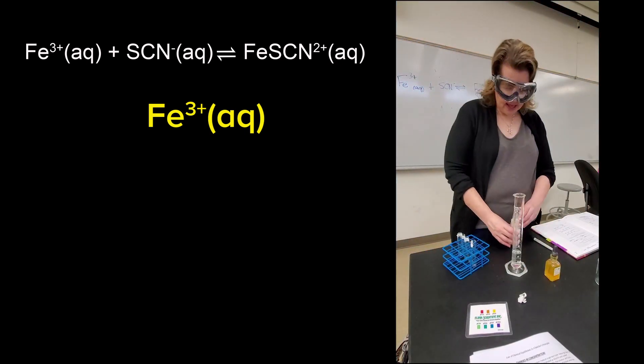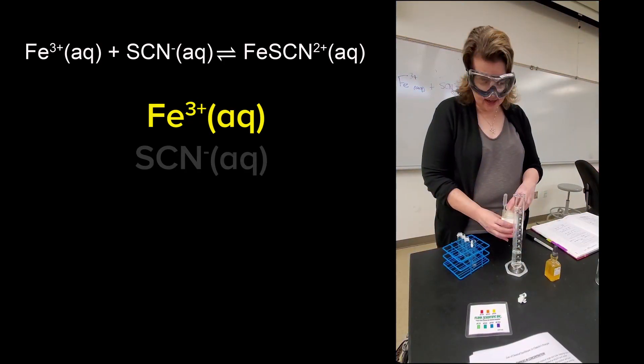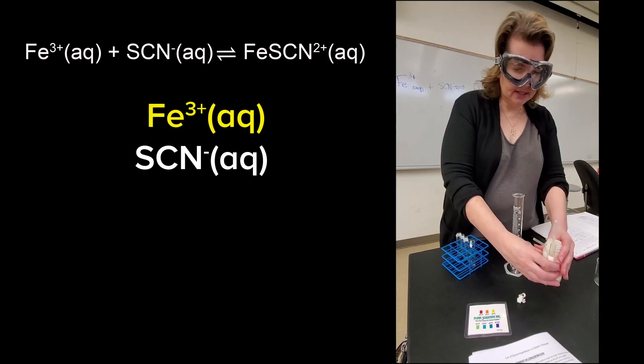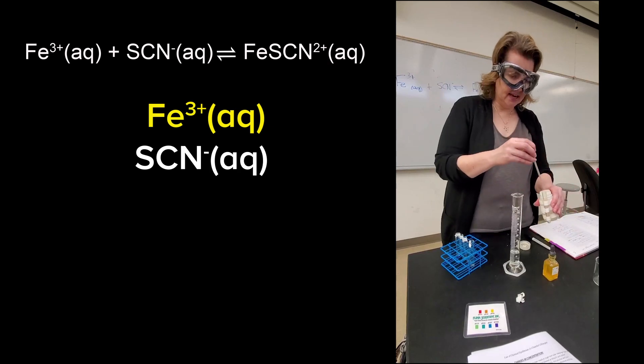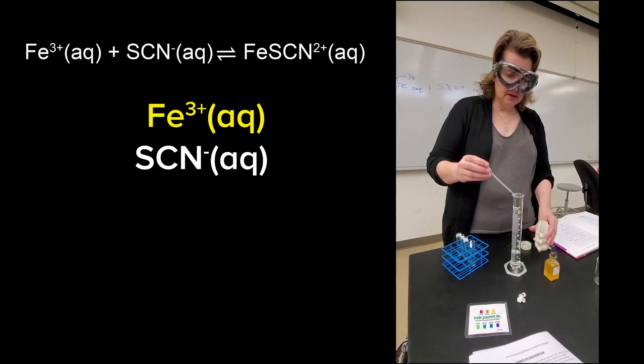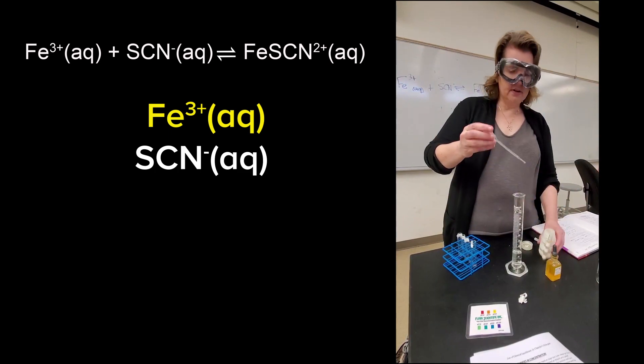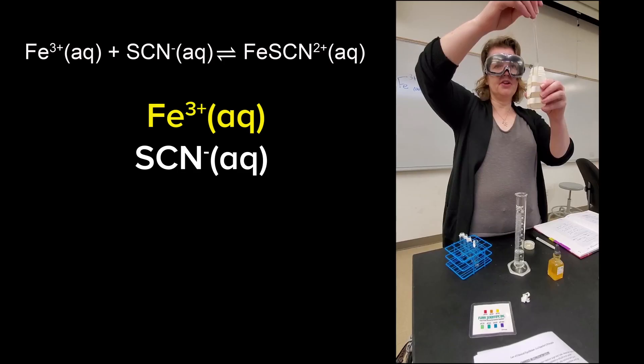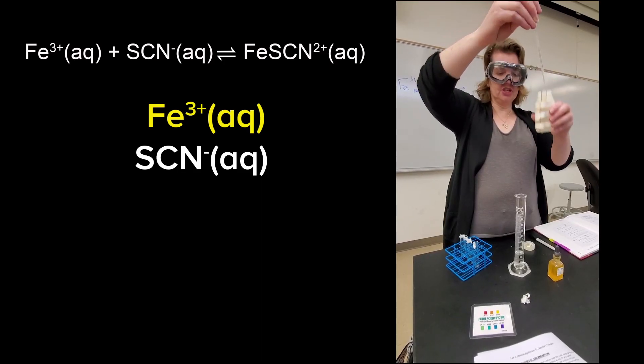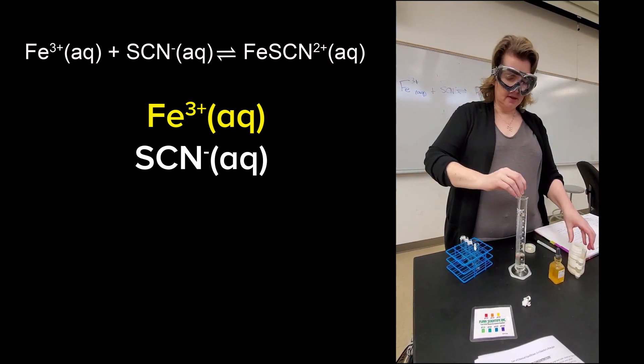So that iron complex is yellow. That's an important thing to note. And then the thiocyanate is clear. And I'm going to add how much of that one? Also half a mil of 0.1 molar. I'm going to really be quick and dirty on that one. I'm going to use the graduation marks.